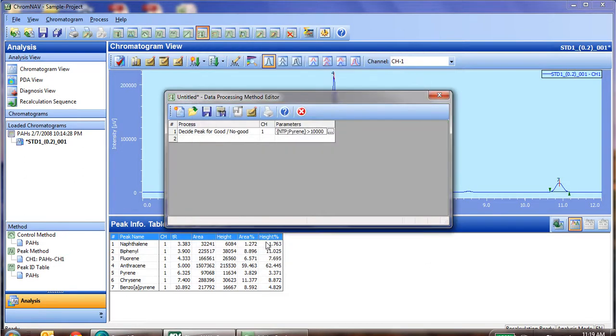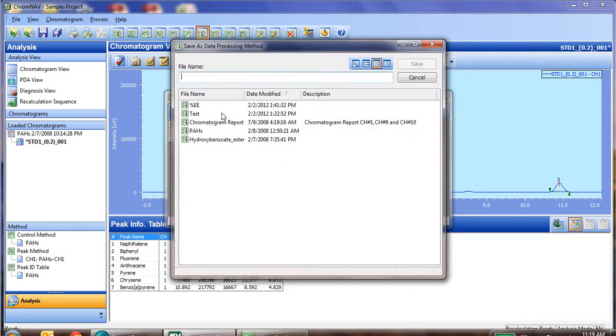We click OK, our formula has been entered, and now we simply save this as our system test.